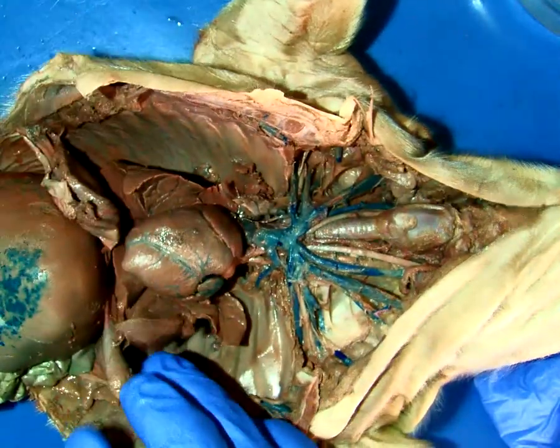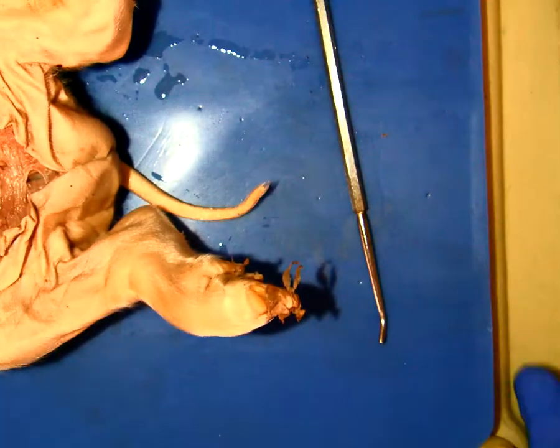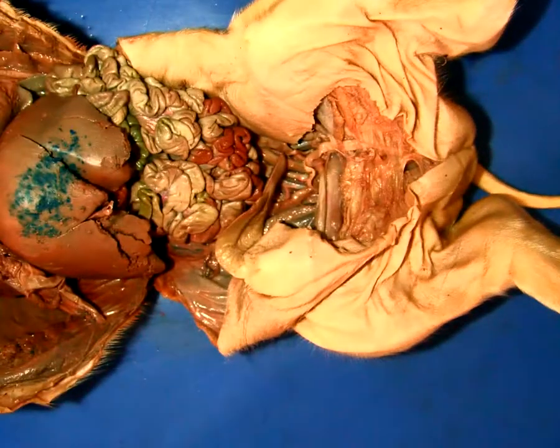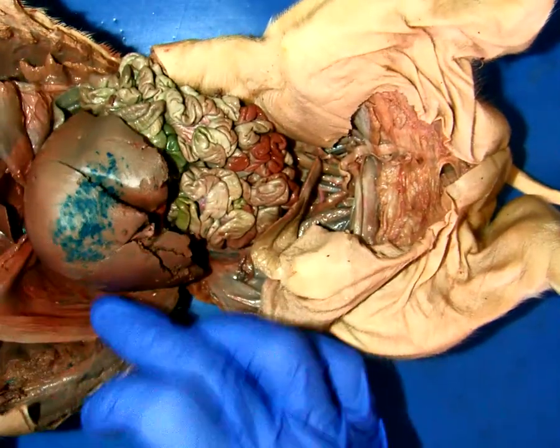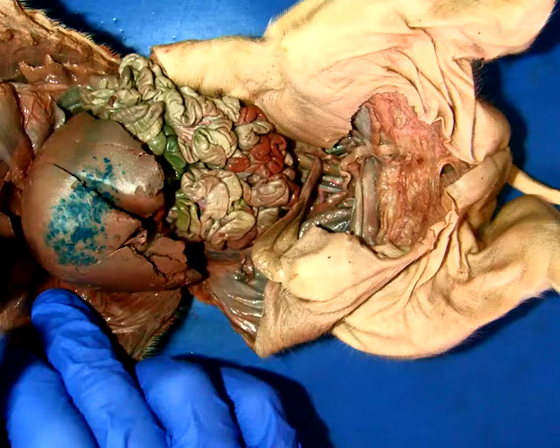So I'm gonna turn the pig around. Don't be alarmed. You need to blink for just a minute. Turn the pig around. Right? And when we take a look at the lower half of the organism, the abdominal pelvic cavity.